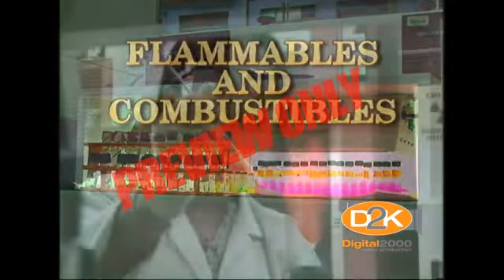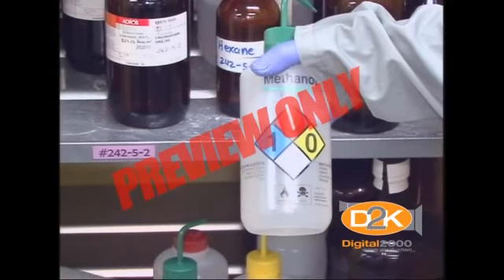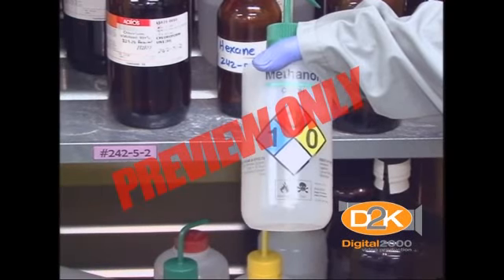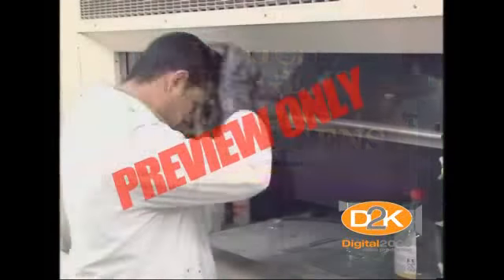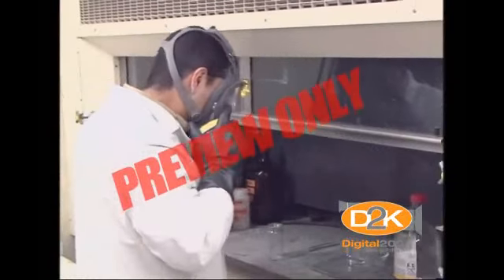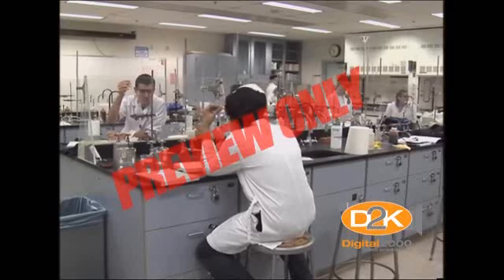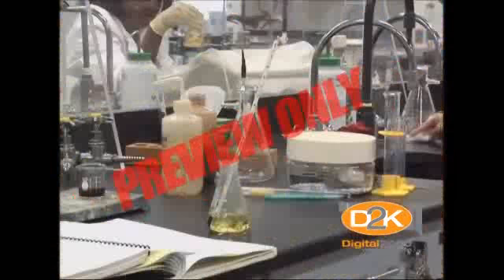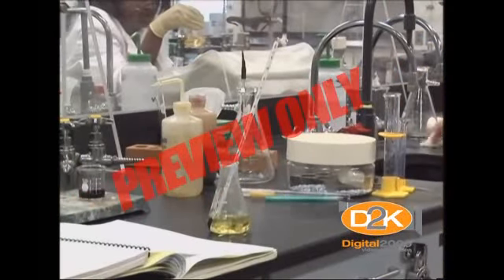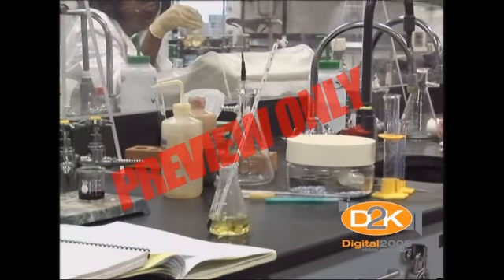Flammables and combustibles. These materials can readily ignite and burn vigorously. Examples include acetone, ethers, and alcohols. Toxics such as mutagens, poisons, carcinogens. These materials may contain a known mutagen or known carcinogen, exhibit oral toxicity, contain toxic metals or pesticides, or are toxic to marine life. Examples include mercury, formaldehyde, ethidium bromide, acrylamide, and ethyl acetate.